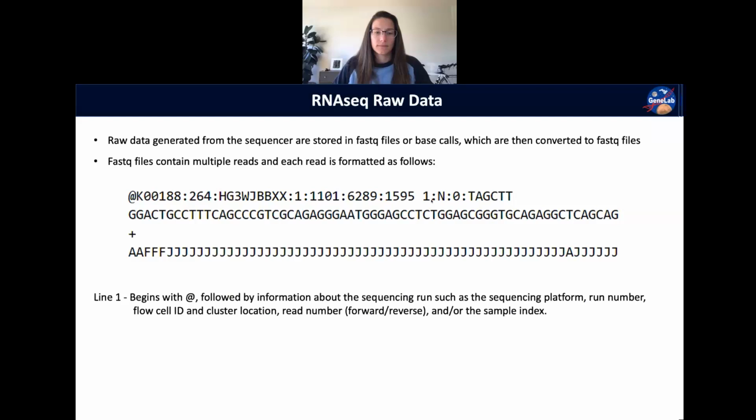Forward, yeah, Diksha, you're absolutely right. So 1 indicates forward. Reverse is usually indicated by a 2. That can get complicated for those of you that are going to be doing an internship and choose to do the UMI. You'll see how that could be different. But in general, 1 indicates forward read and 2 will indicate a reverse read. So this is indeed a forward read.